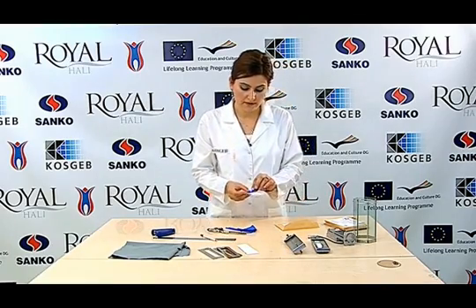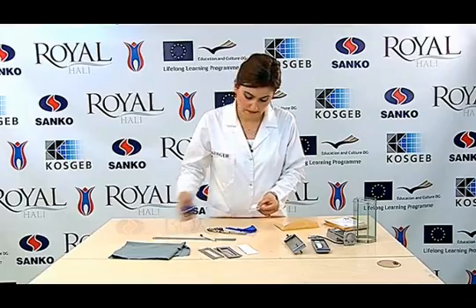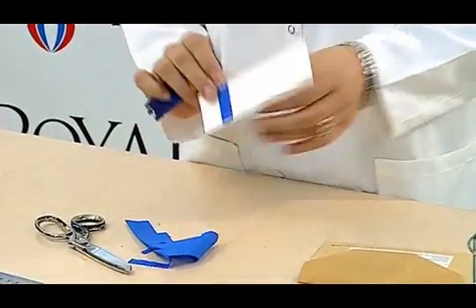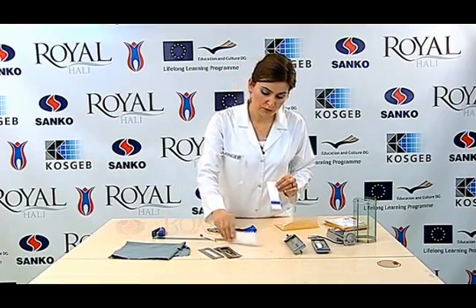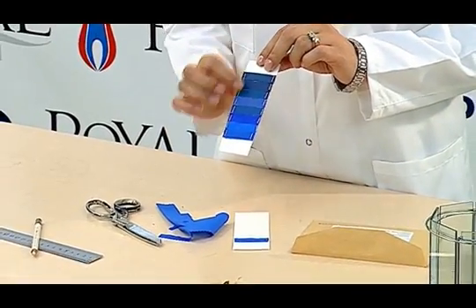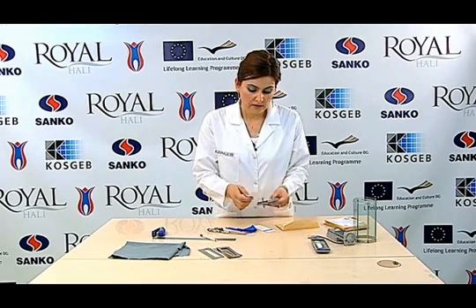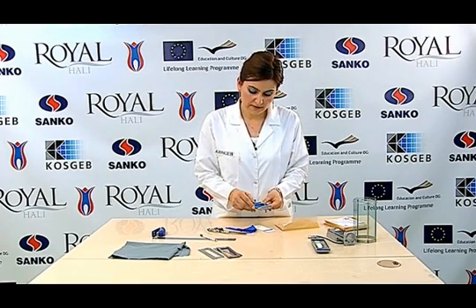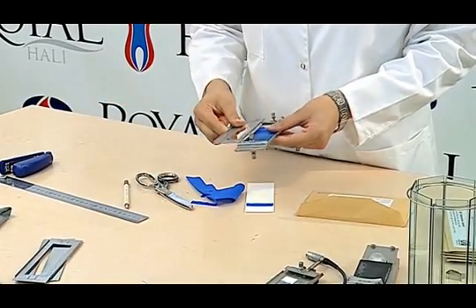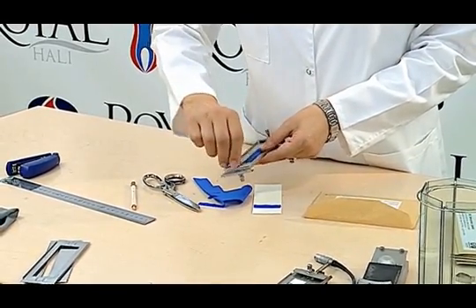We punch the first blue wool reference that we have prepared at the initial point. We punch blue scale numbers 1 to 8, prepared in this way, onto the opaque cardboard with the same ones in the same size. In method number two, we have the opportunity to test more than one sample at the same time, and the section exposed to light with a mask is left uncovered.